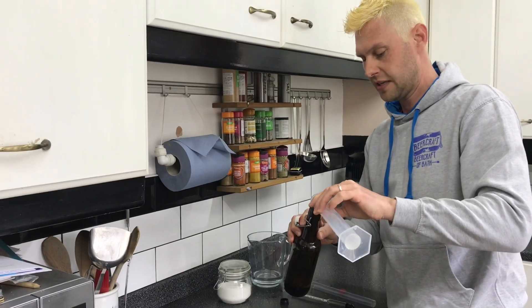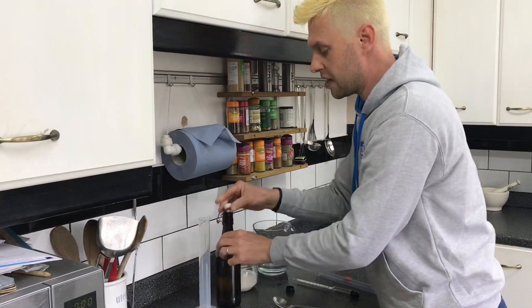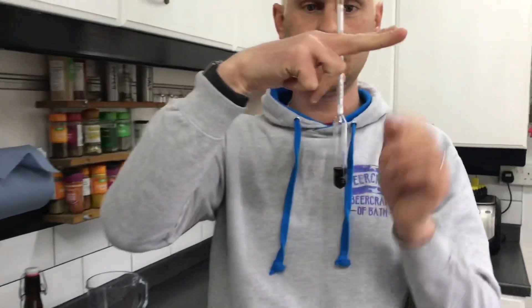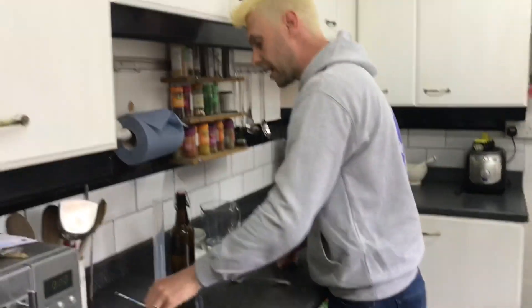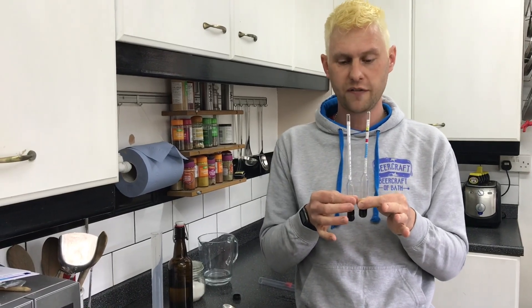Hopefully that's given you an insight into the two different hydrometers and how to read them. They're read in exactly the same way — you drop it in and take a horizontal reading. If you look down at it from above, you'll get a false reading. Our beer and wine hydrometer and our spirit hydrometer look very similar but do very different jobs. Any questions, pop them in the comments below and I'll try to answer them for you.